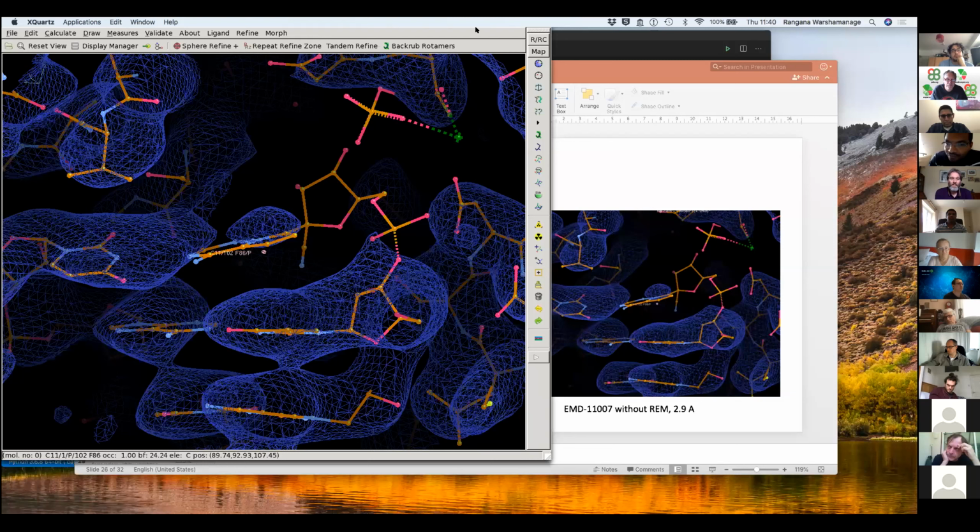I also think that in the model where there's no remdesivir, the adenine is likely to be more flexible because it's a terminal adenine, and the stacking energy of remdesivir is better than just adenine. So you will have a more stable stacking there, and I guess you tend to see more density for that reason as well. But why is the stacking stronger?